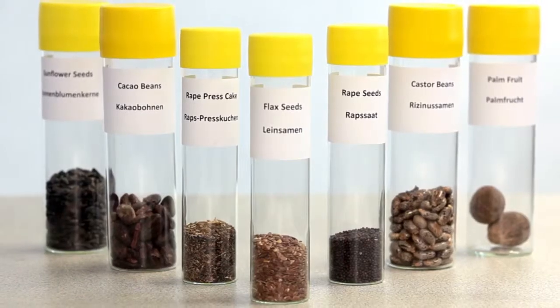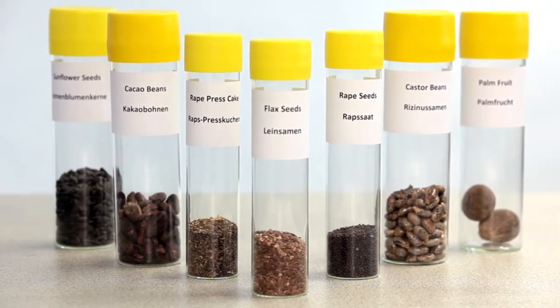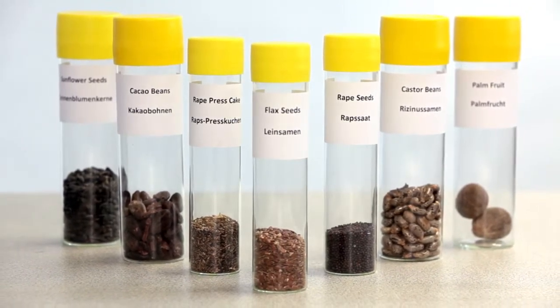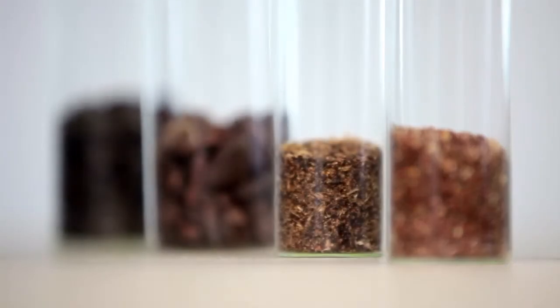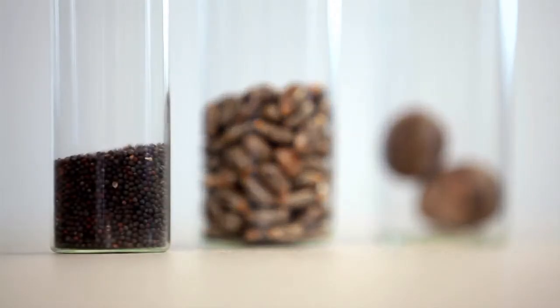In a broad variety of seeds, oil and moisture can be determined. Oil seeds like sunflower, rapeseed, or flax seed can be analyzed. In addition, various seeds, nuts, almonds, soy and cocoa beans, olives, or palm kernels, as well as press cake residues can be analyzed.